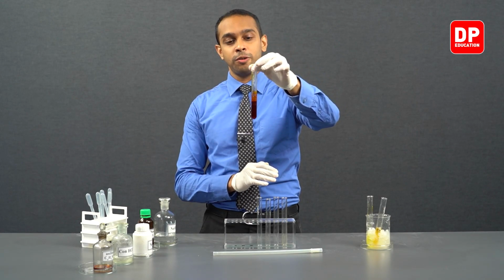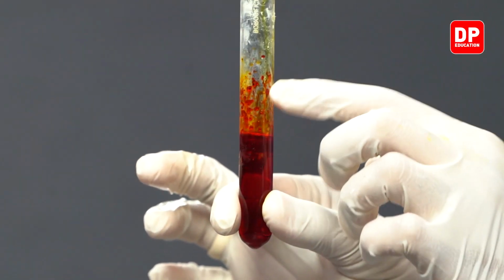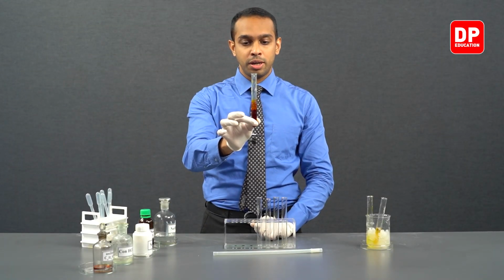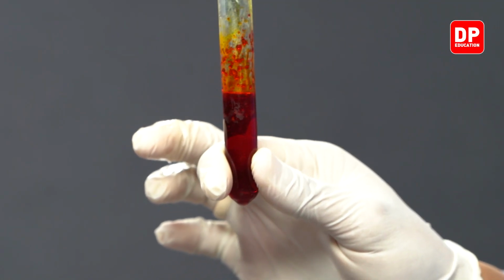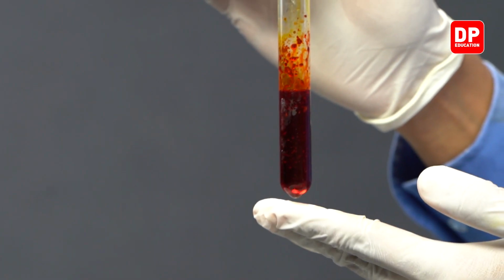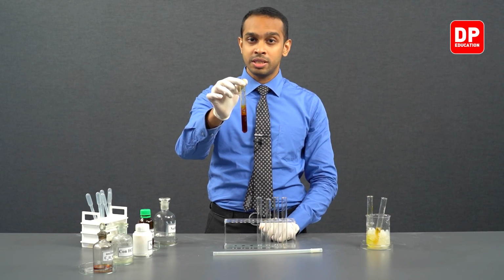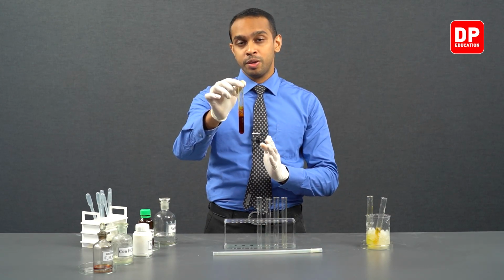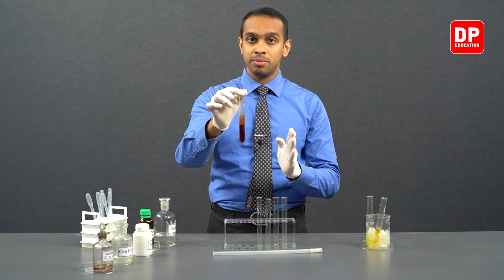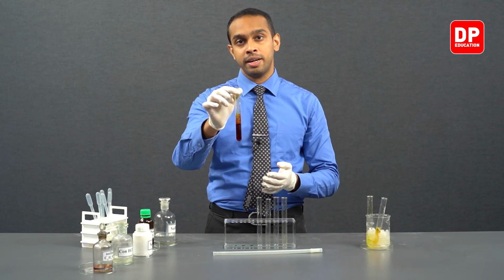of the dye that we have formed. And you can see what we have formed is a precipitate. You can see by observing the walls of this test tube, the precipitate that is formed is a red-orange color. So this is more towards red than orange. So what we have formed here is p-hydroxyazobenzene, which is azo dye. So we formed this azo dye through benzene diazonium ion. Now this is a test that we can use to identify aniline.